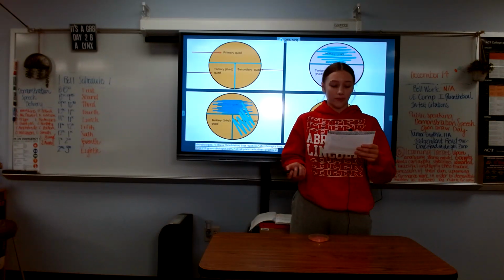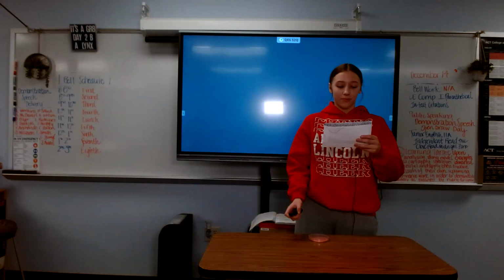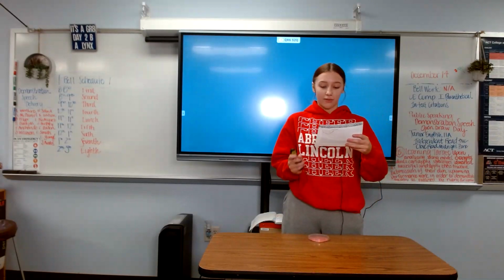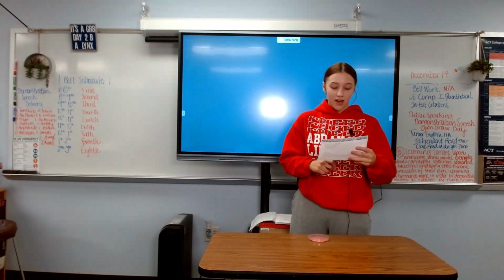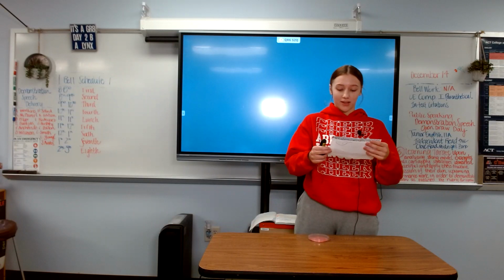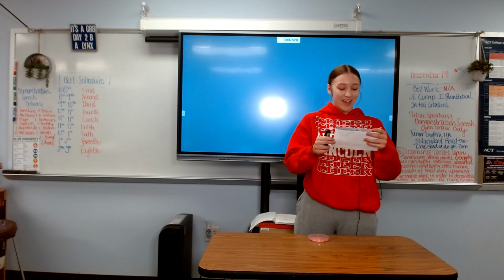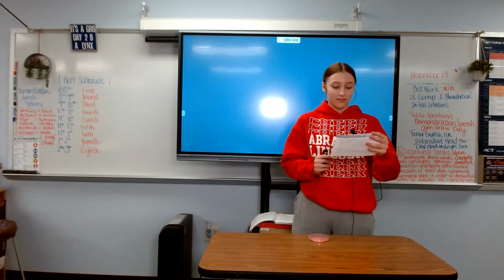So streaking for isolation has benefits to society because this specific technique allows microbiologists to study one specimen without the worry of contamination of others. It is very important for microbiologists to get a specific and right diagnosis for these patients. It plays a huge role in combating disease, in analyzing microorganisms up close, and helping keep the planet healthy.